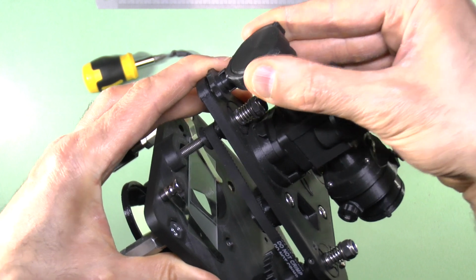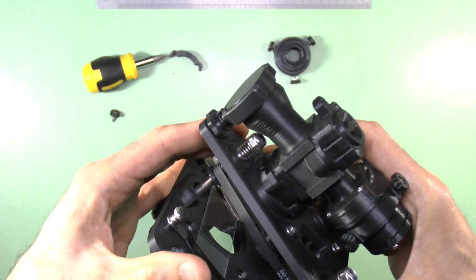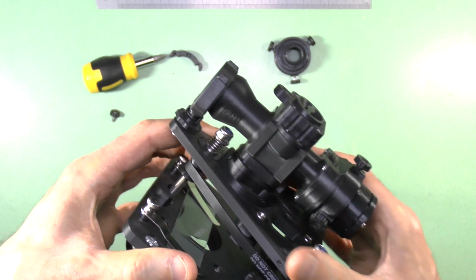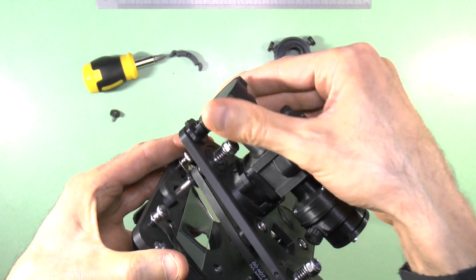Now you can clip the articulation into the stay thumb wheel. Rotate the stay thumb wheel a further quarter turn to ensure the articulation won't come out.